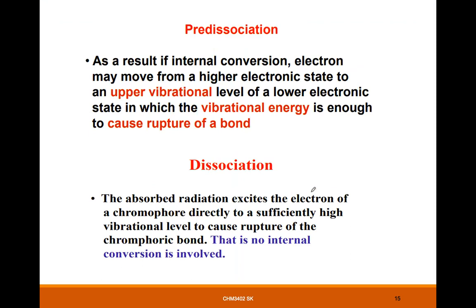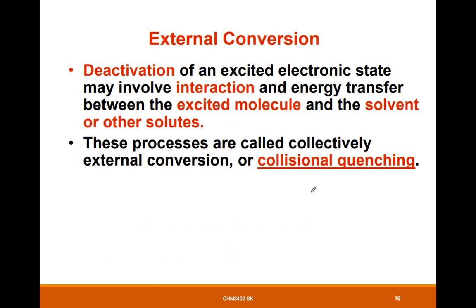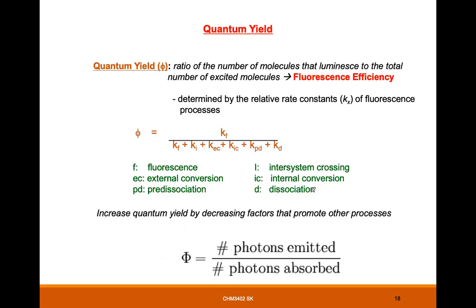Because if you are using just IR, there is no dissociation of atoms, okay? Only the vibration, right?